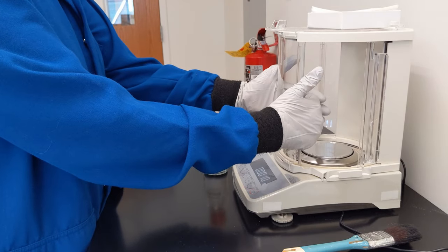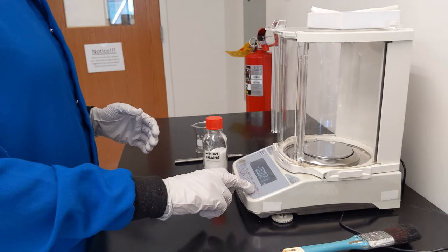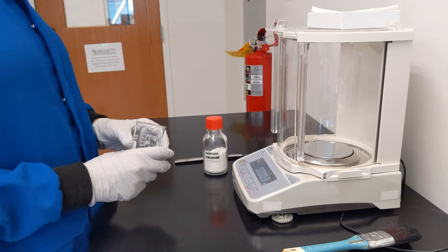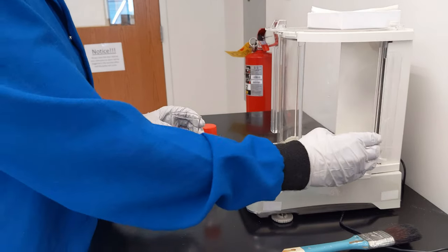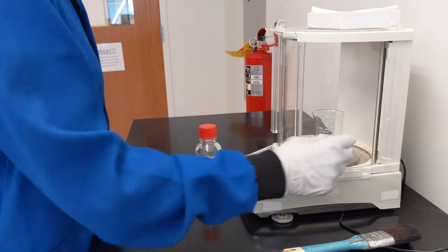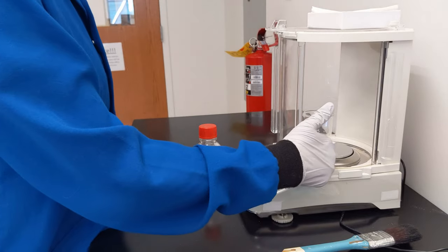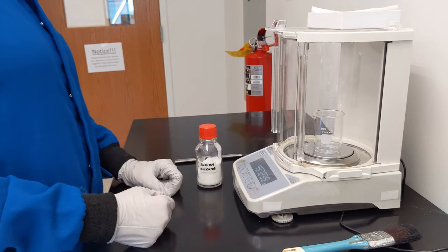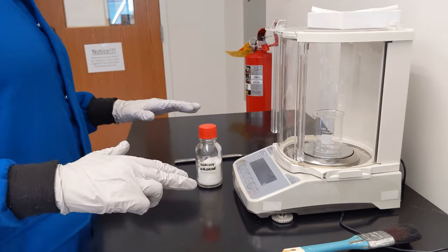Right now they are open and I can access the inside. I'm going to measure out some mass of sodium chloride into this beaker. I need to open the wind guard and place the beaker right in the center. If it's off to one side, that will alter my values — it needs to be as close to the center as you can get it. Close the wind guard, get your hands and weight off the table, and press Zero or Tare.